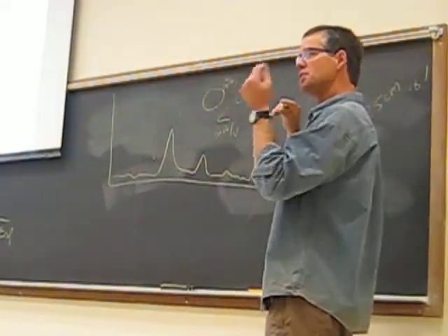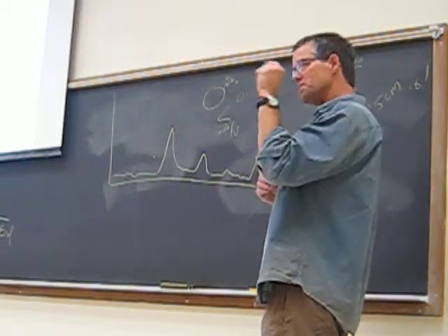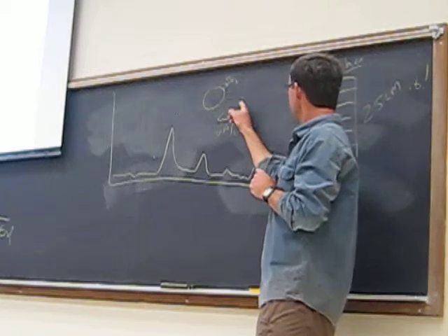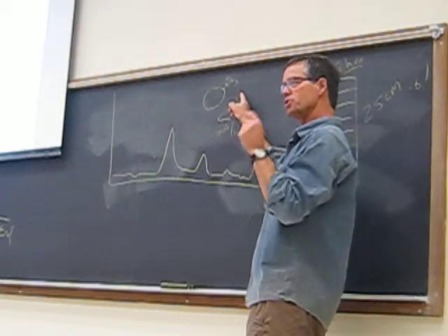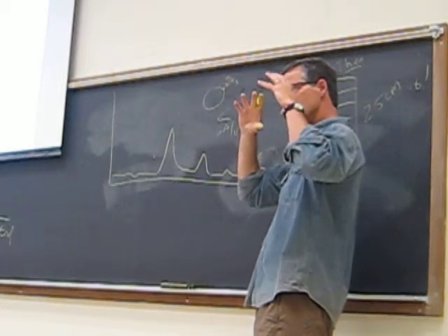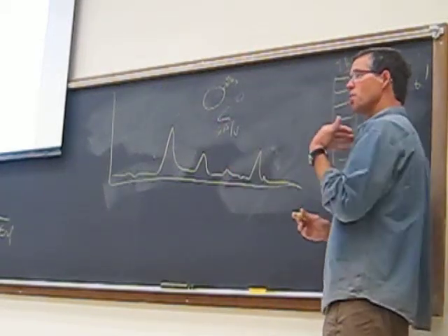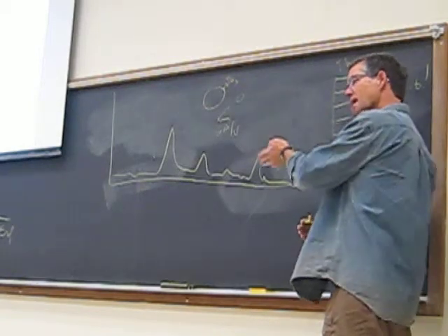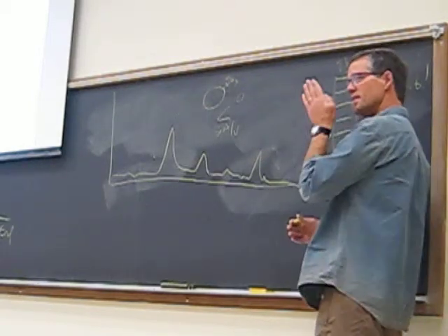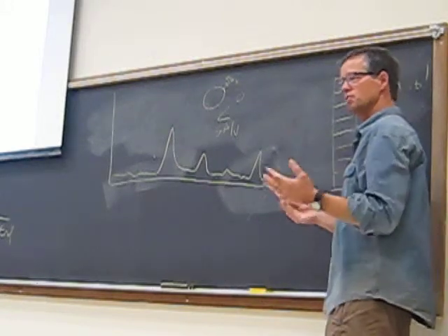The only way I can achieve that is by decreasing the plate height, and the only way I can achieve that is by having smaller beads, where I have a larger surface area to volume ratio and a greater amount of exposed stationary phase surface area in my column. So what do I do? I don't do anything physically other than get on the computer and buy a different column that has a different bead size.